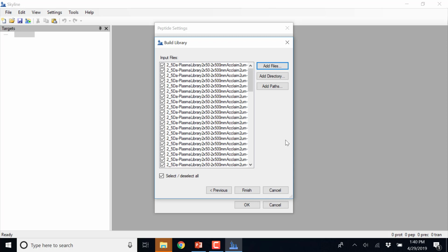Hit browse, and you have to make sure it's in that documents directory or wherever you're saving everything. Just go to documents, which is right below the desktop that you just clicked on the left. Once you update that directory, then hit next, and then you should have access to all those files. How many people are having problems finding these MSF files?